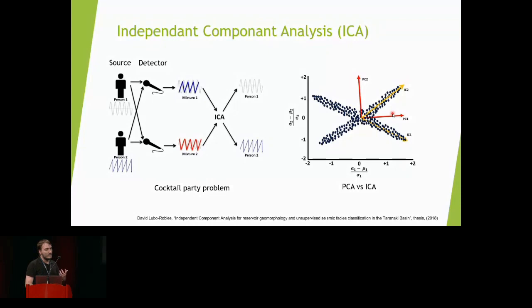However, with ICs, independent components, you will be able to immediately and directly detect each specific type of signal within your samples. These independent components are also independent from one another, meaning that if you detect a signal you're not interested in, such as noise or a biological process you don't want to keep for the remainder of your analysis, such as apoptosis, you can remove it easily in order to not take it into account.